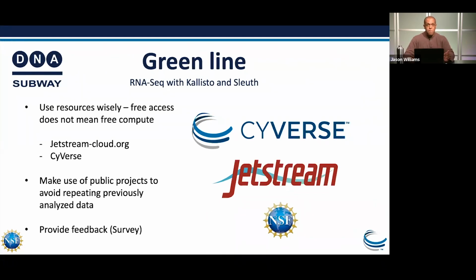So another speed up that's made this possible is that we're using the cloud. We're making use of a spin-off project, but a separate project from CyVerse, called Project Jetstream, which is a large open science cloud. If you're doing education, research, or teaching, I really encourage you to look at that. But just because you can click a button on the Greenline doesn't mean you should click every button on the Greenline, is essentially my message.